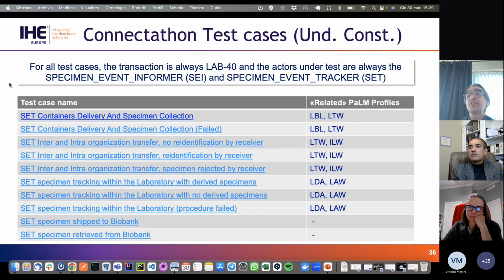also creating the HL7 V2 profile needed for Gazelle, for the Gazelle validators, because one of the most popular tools, I can say, that is available to the vendors for every profile that is related to HL7 V2 transactions, but not only to V2, also to other standards, is the validator that allows to validate the exchanged messages inside an IHE transaction.